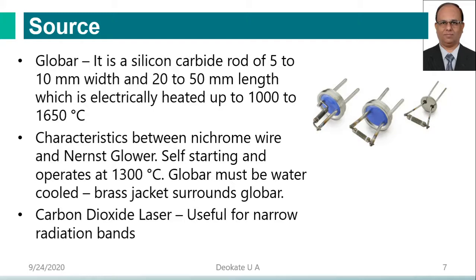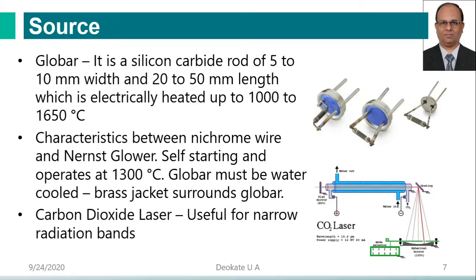Carbon dioxide lasers are used in today's FTIR instruments. They are useful in narrow bands and they are a modified form of the sources which are there in the FTIR instruments.